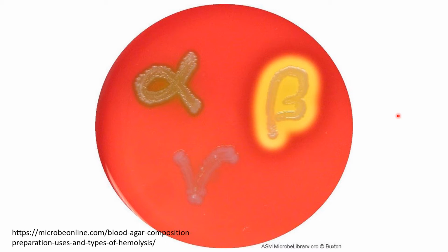Today we have bacteria as part one, and then for part two on Friday, I think we're going to discuss protozoan and fungi. Okay, so this is a blood agar, instead of a regular agar plate. This blood agar is a bacterial growth medium also, but it's kind of enriched. So why do we need to use an enriched bacterial agar plate?